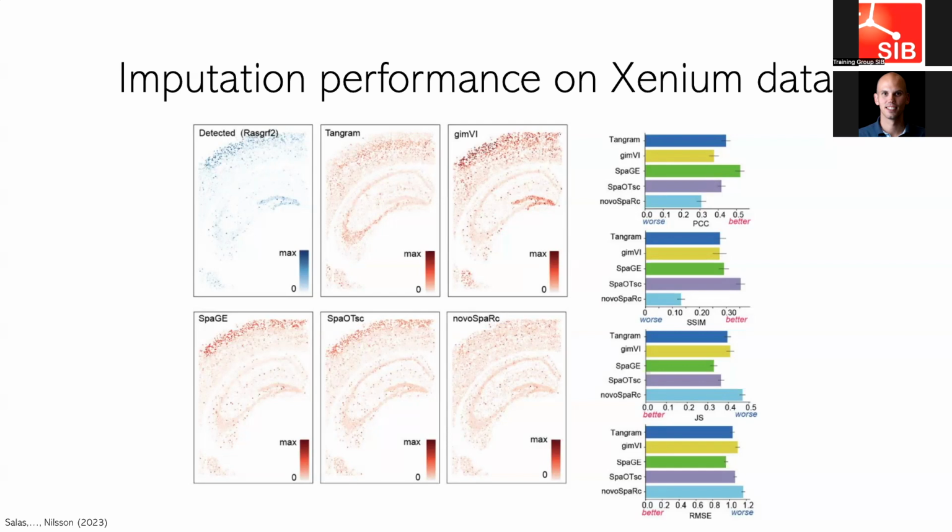It's the top one. But if you look visually at the results, they are actually very similar, right? So the differences between the methods are also not that large. There is more to these benchmarks also in terms of the computational power and the RAM that you need, and so on. Also quite important: if you would, for example, try to run the MERFISH atlas from the Allen and try to predict all the missing genes over there, then it becomes quite problematic for a lot of these methods.